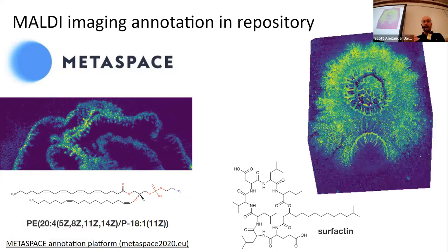For instance, on our side of natural products, we have run a co-culture where we have 2 bacteria competing, and it annotates it back as these cyclic lipopeptides that are used in competition. So this is a really useful resource for the imaging community. So I wanted to point that one out.